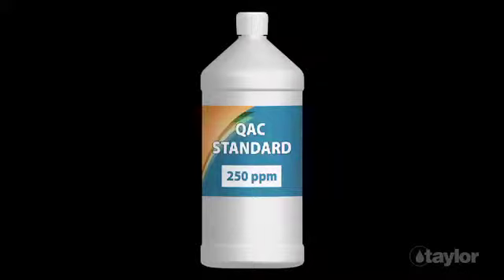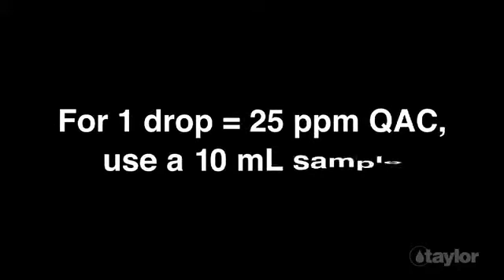Note, equivalences for quaternary ammonium compounds and polyquats, other than those listed in the instructions, must be determined by titration with a known standard. For 1 drop equals 25 parts per million QAC, or 9 ppm polyquat, follow the same procedure using a 10 milliliter sample instead of a 25 milliliter sample.